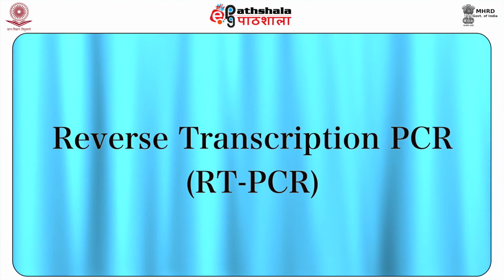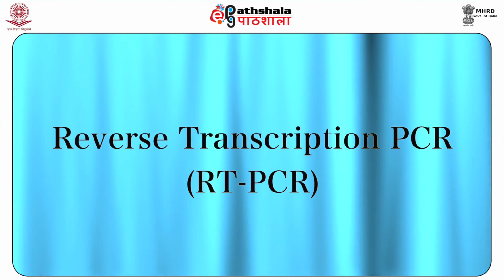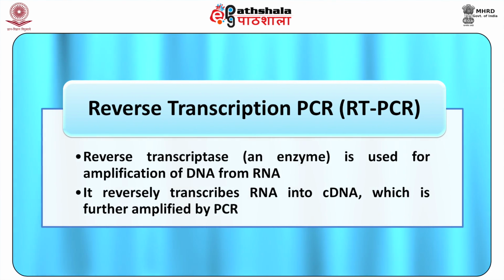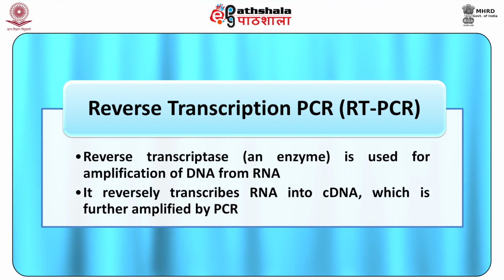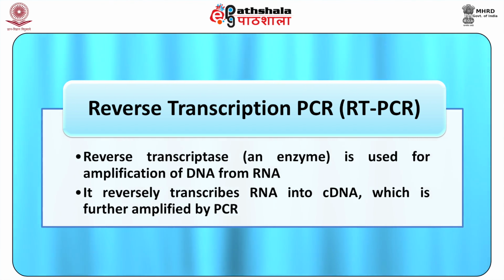Reverse transcription PCR, abbreviated as RT-PCR. Most PCR reactions are conducted with DNA templates. Reverse transcriptase, that is an enzyme, is used for the amplification of DNA from RNA. It reverse transcribes the RNA into cDNA, which is further amplified by PCR.